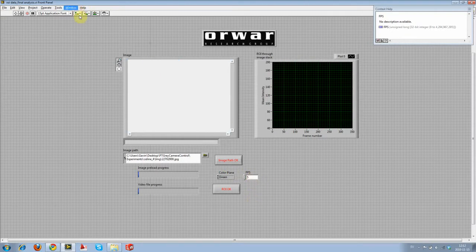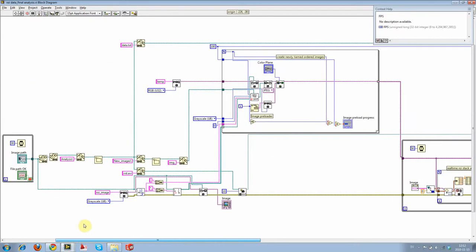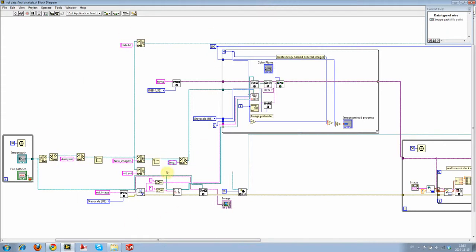Let's look at the background. It looks overwhelming, don't worry, we'll step through it. It also looks a little bit scattered. We can group together certain actions. I left it like this so that you can follow it a little bit easier with the wires. All of this original structure, and to some extent some of the things in here, is here so that the files go in the right places. We have to make new folders, and we want to make the program do this. We want to choose our file and then it takes care of the rest.